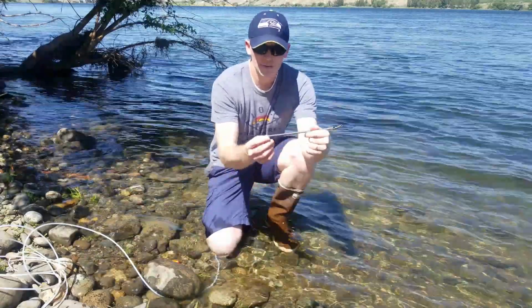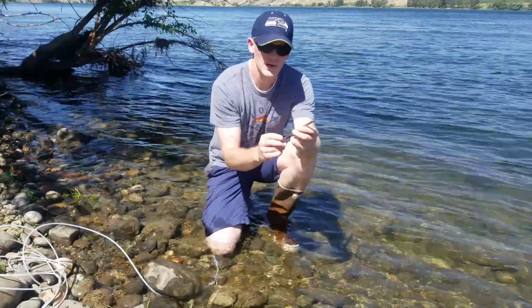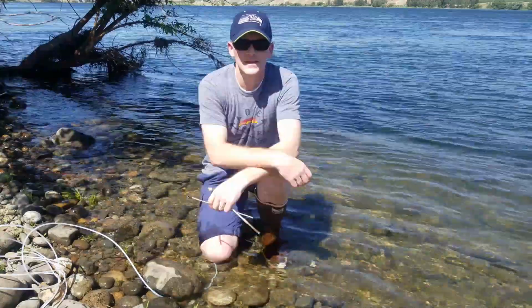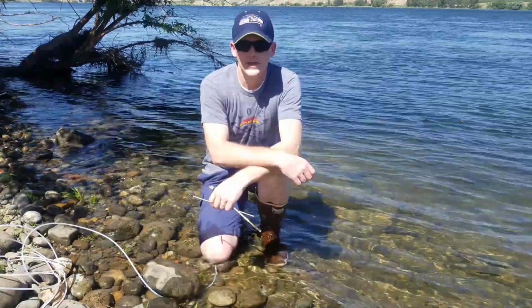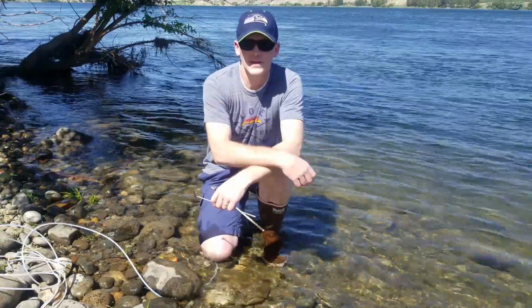Depending on your substrate, your push point might also be a little bit bent at the end. You can try to straighten that out by pushing the support rod in and gently straightening the tip of the push point. The last step before you leave the field site is to take a picture of your hard copy metadata sheet, which will be uploaded as part of your metadata.